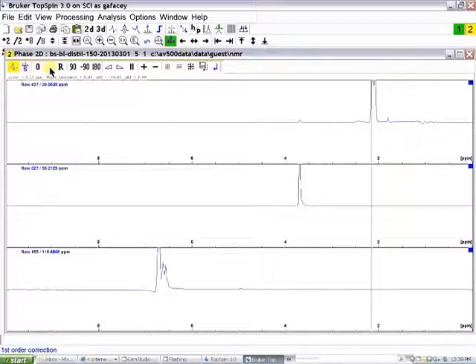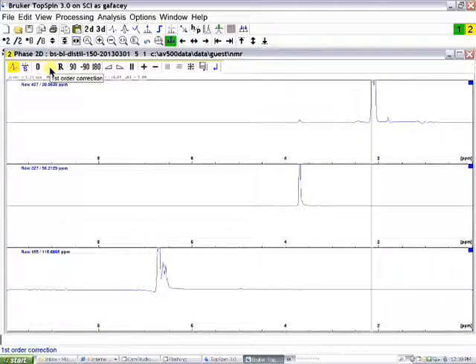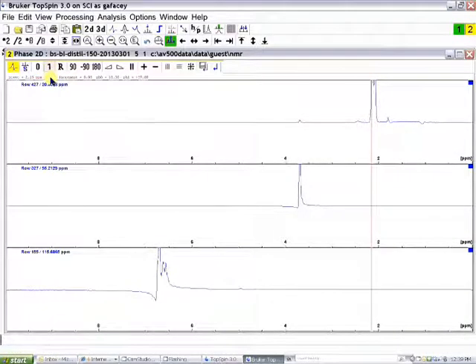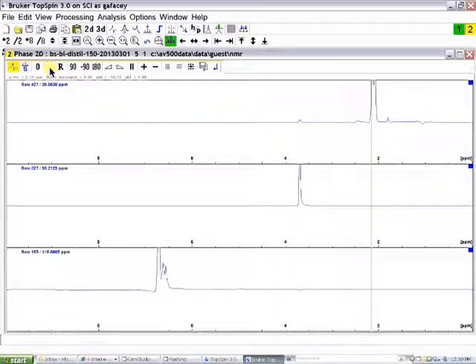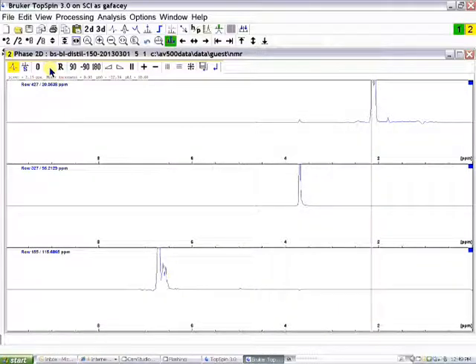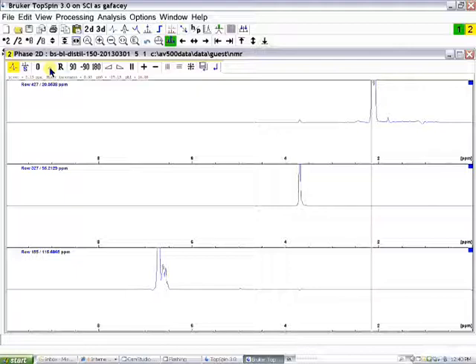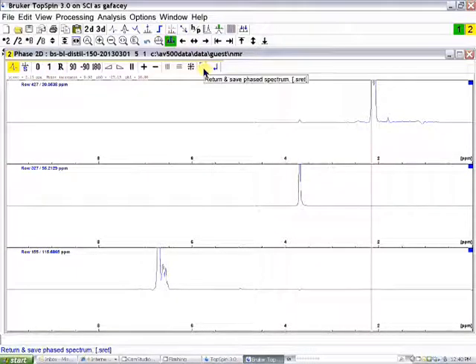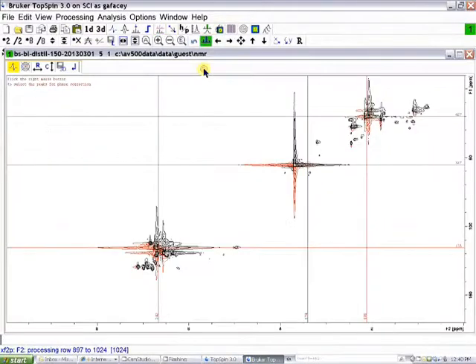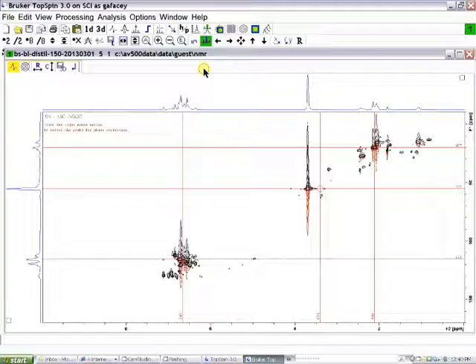Then I would click the one icon, which is for first-order phasing, and drag the mouse up and down until the spectrum on the bottom is in phase, as it is now. The spectrum in the middle should, of course, be in phase as well. Then I would click on the Save and Return icon.